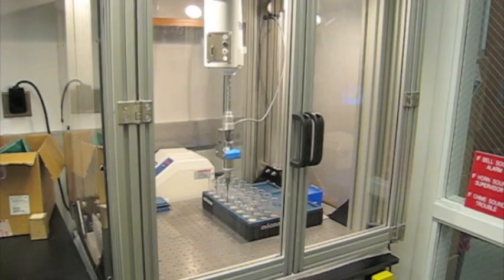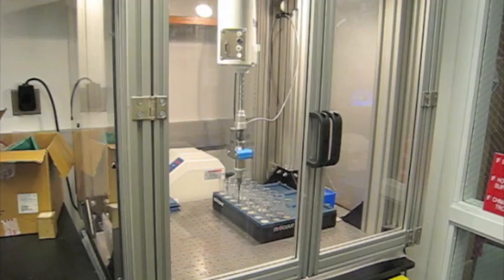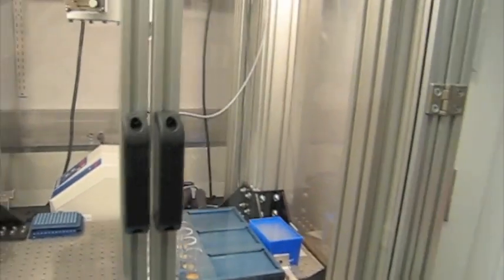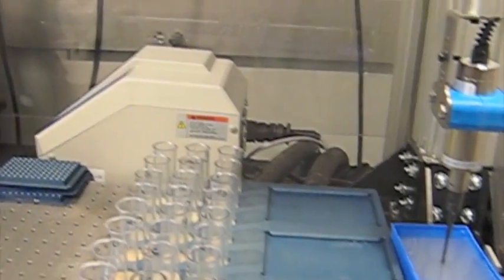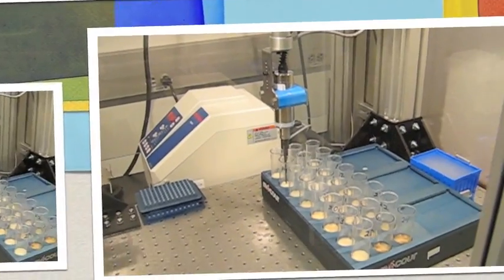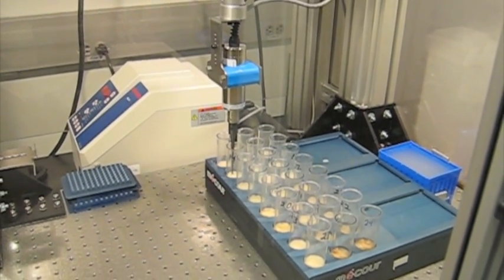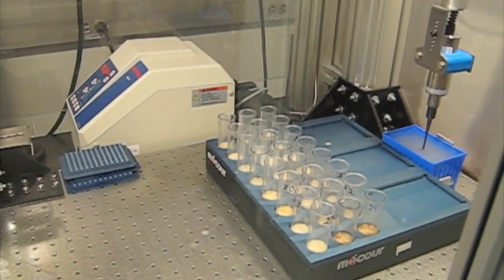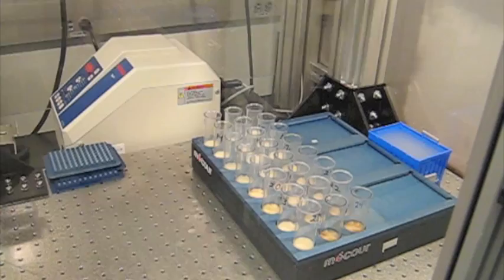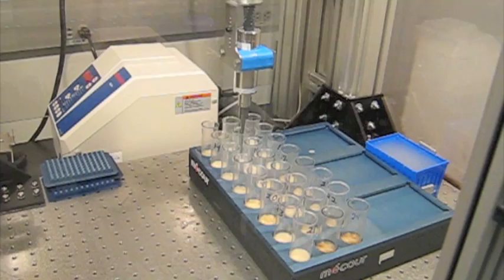This is the Sonicator Susie performing sonication on 24 50mL tubes. The program automatically selects the duration of the sonication pulse based upon the volume and the tip selected. The pulses are arranged so that there is sufficient cooling time in between for each tube.